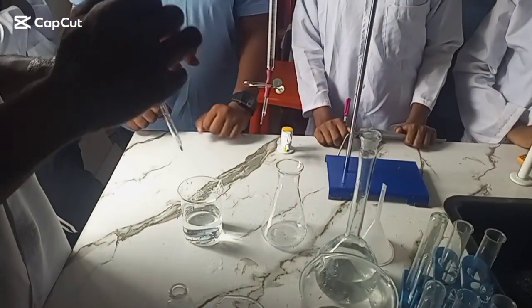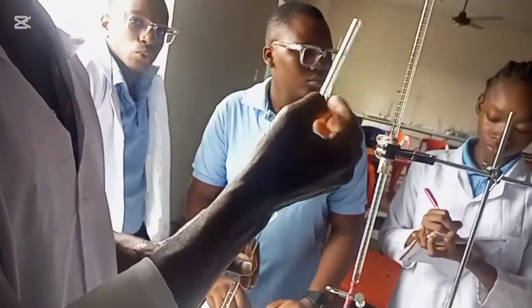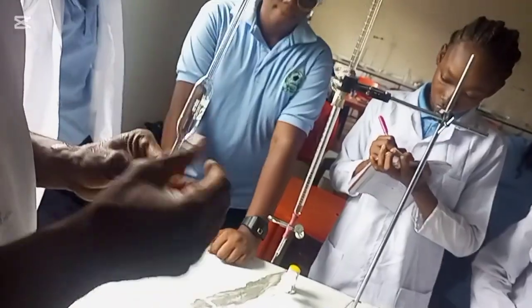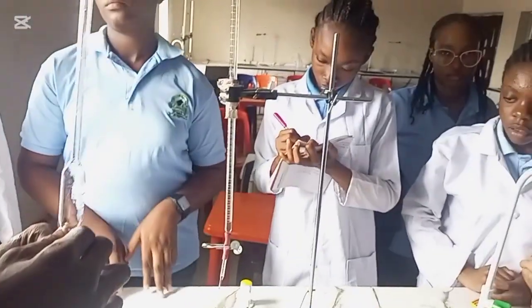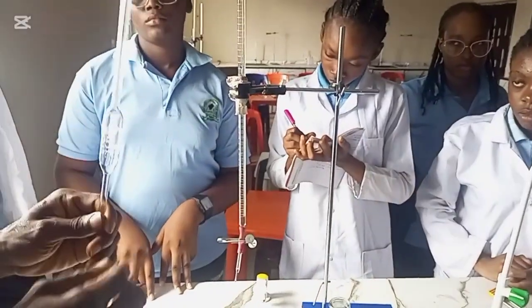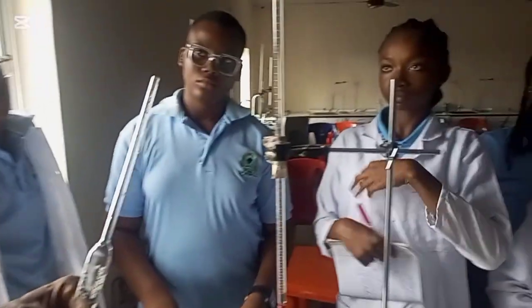Okay, so this is our pipette. The volume of this particular pipette is 25 ml. We always use either 25 ml or 20 ml, but whatever we are to use, we will use it. All the pipettes in this school, in this our lab here, are 25 ml. It doesn't affect anything. All you need to do is note it down that you're using a 25 ml pipette.